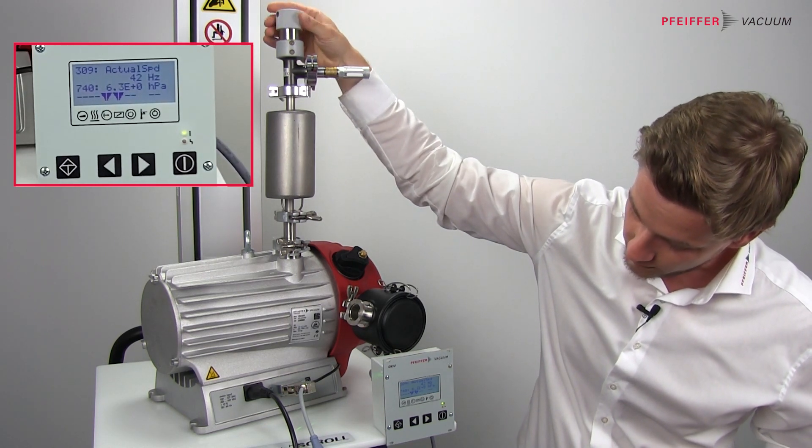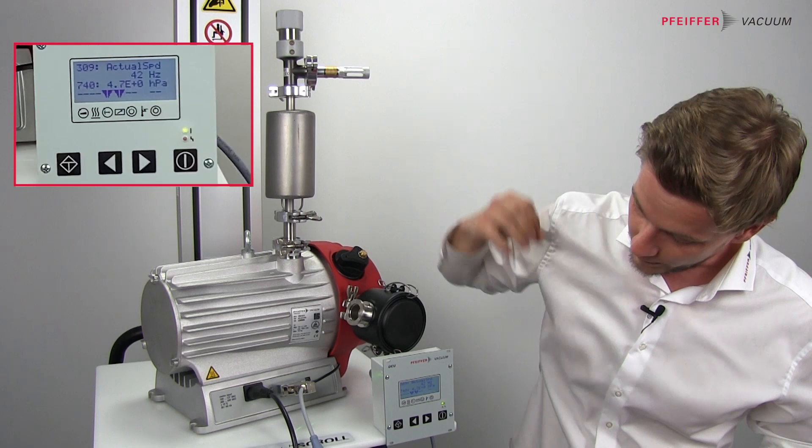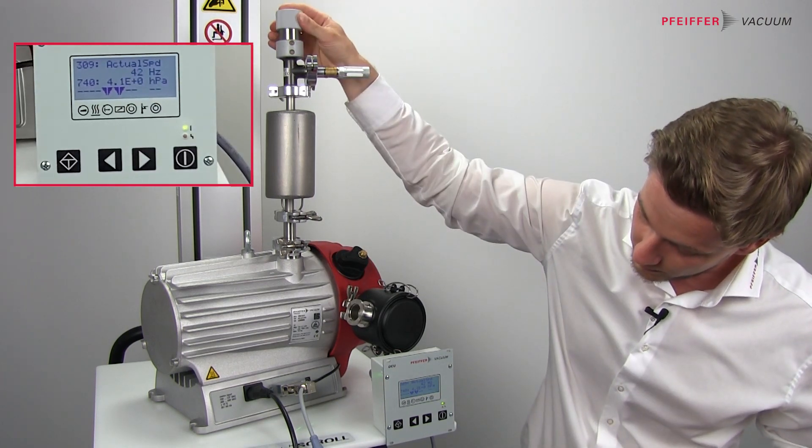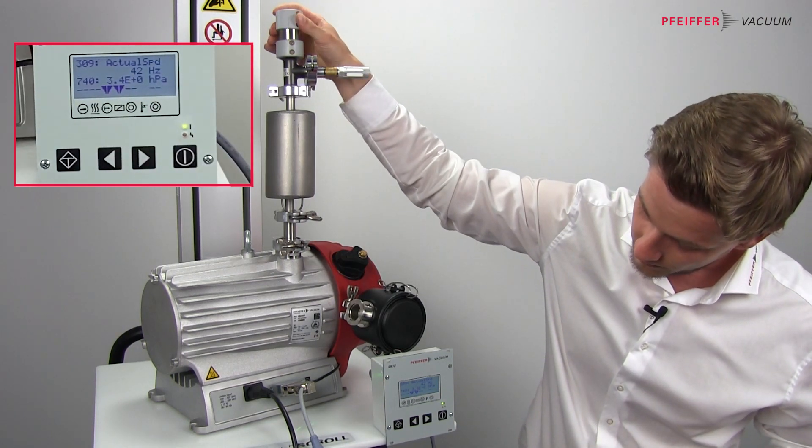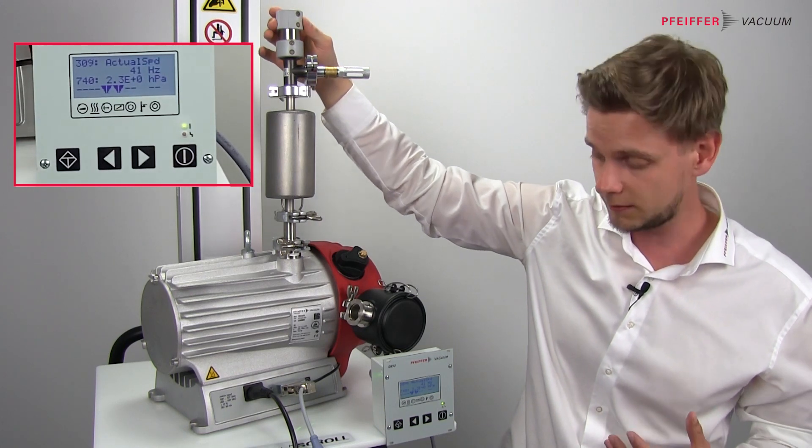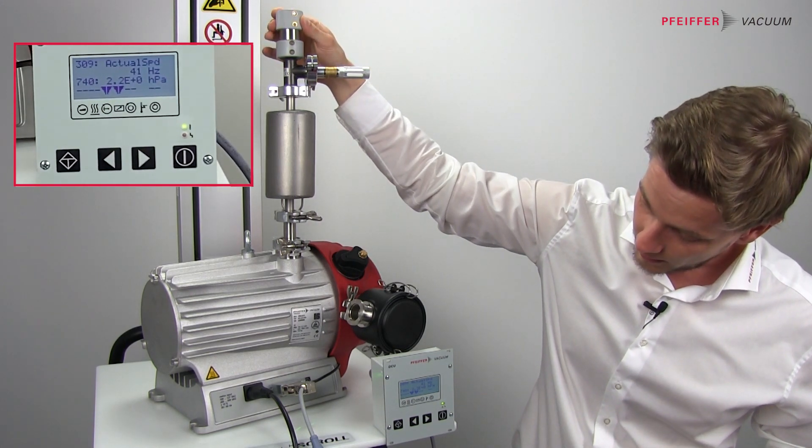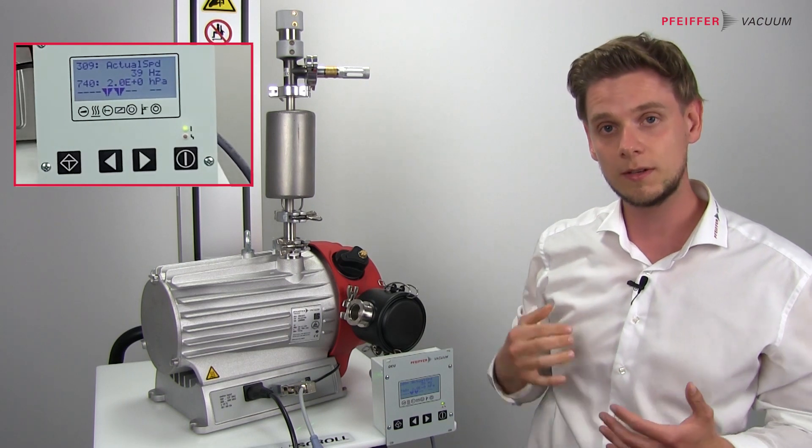And then the pressure decreases. When reaching the pressure and the speed is sufficient, the pump detects that the speed can be decreased and you can hear that the sound is dropping.